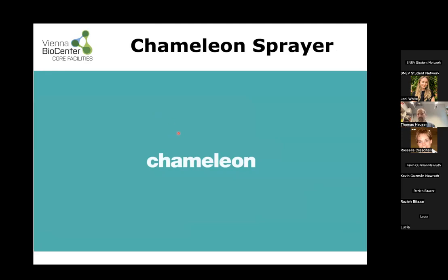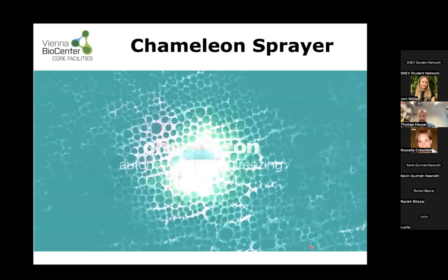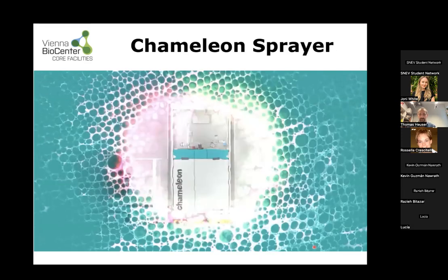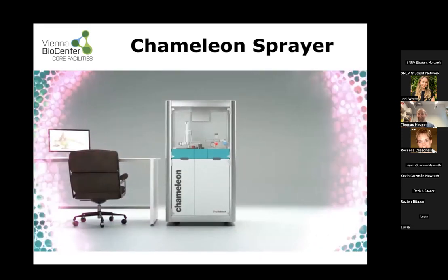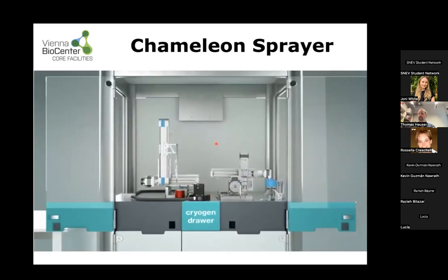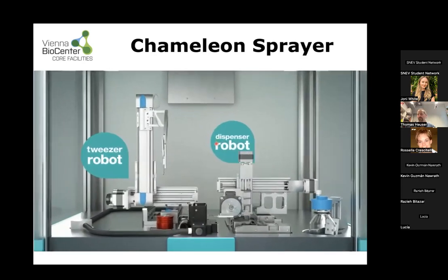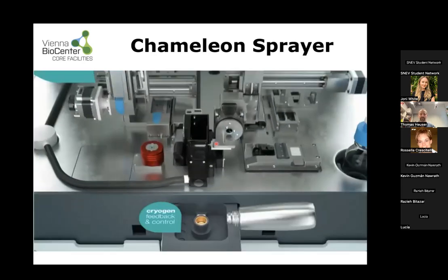Another alternative I wanted to show you is called a sprayer. And we even have music with it, or I'm not sure if you can hear it. This sprayer works very similar to an inkjet. And again, this is also a commercial video by the manufacturer. Take it with a grain of salt.